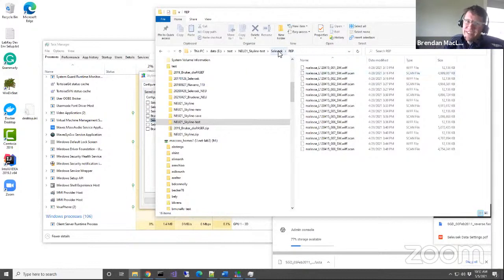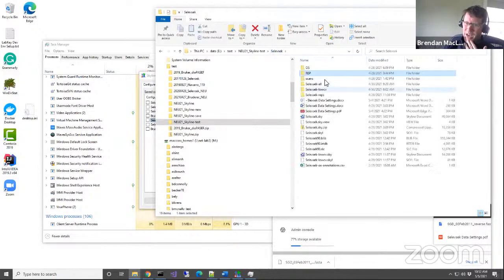Certainly, it's applicable if you're going to take something to a clinical quantitative assay. You need to do much more extensive repeatability experiments. Andy Hufnagel, who we work with, suggests a 5x5, where you do 5 replicates on 5 separate days and look at the CVs for those.